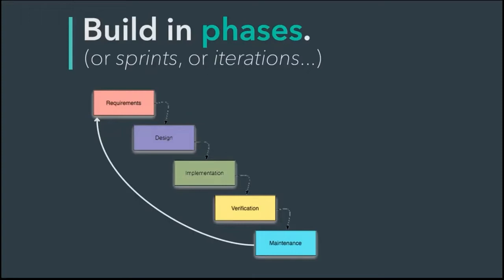Now, there's nothing really wrong with these 5 steps, but as we saw in previous slides, if it takes months or sometimes a year or more to complete one round of this cycle, then you're going to run into problems in R&D. So what we wanted to do when we were building our R&D work cell was to still go through these 5 steps, but shorten this cycle from months to the span of weeks. And for us, this meant developing small chunks at a time, continuously deploying these chunks in lab, and constantly working closely with our scientists to figure out the next cycle.